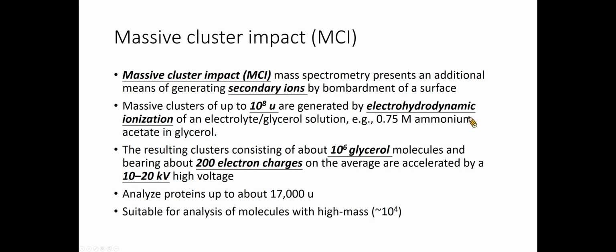The resulting clusters, consisting of about a million glycerol molecules and bearing about 200 electron charges on average, are accelerated by a 10 to 20 kilovolt high voltage.